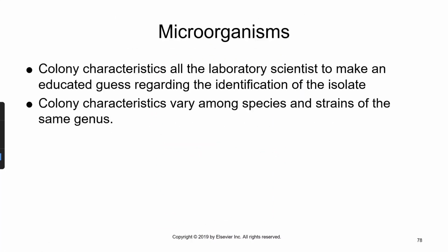Microorganisms' colony characteristics allow the laboratory scientists to make an educated guess regarding the identification of the isolate. Colony characteristics vary among species and strains within the same genus.